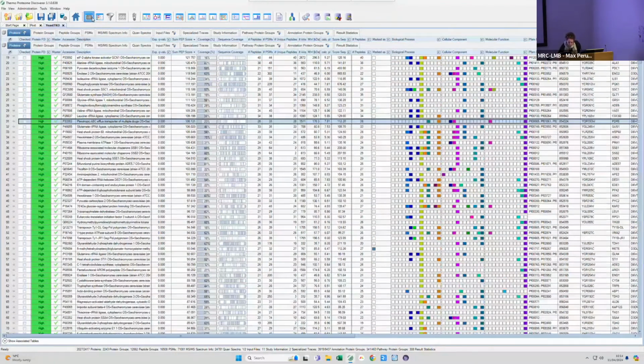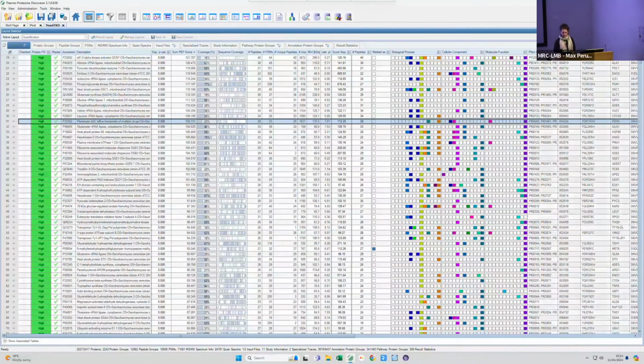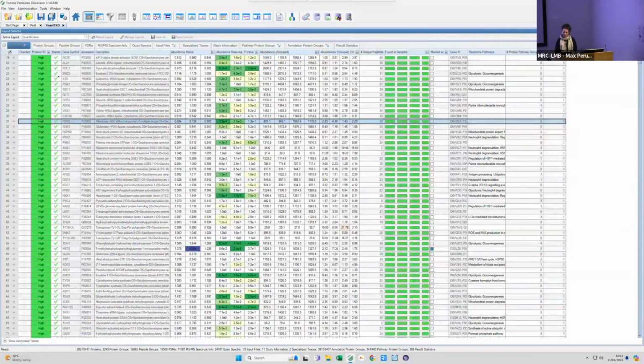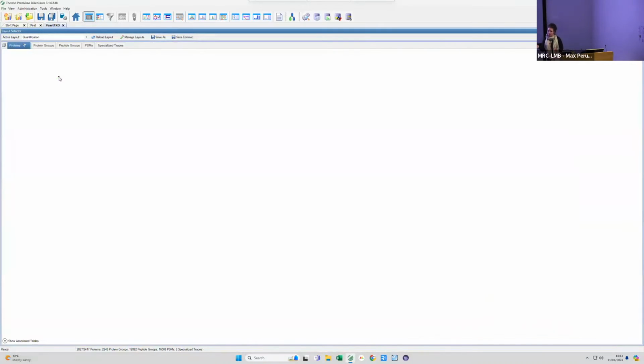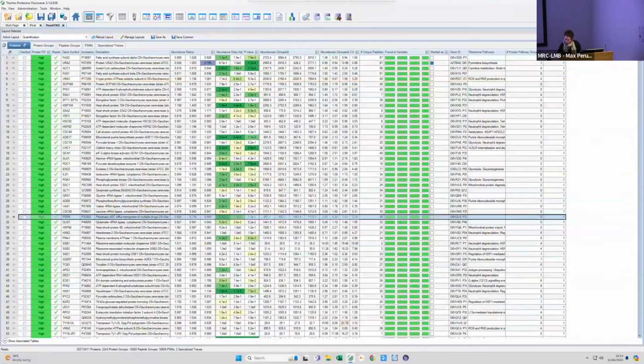You might want to filter for quantification or change the layout for quantification so it gets less complex. You can always change back to different layout settings. So if you prefer to do the pre-analysis or you're filtering in a narrow way of looking at the data, you can do so and then revert back to a different layout afterwards. That's absolutely fine. So change the layout.